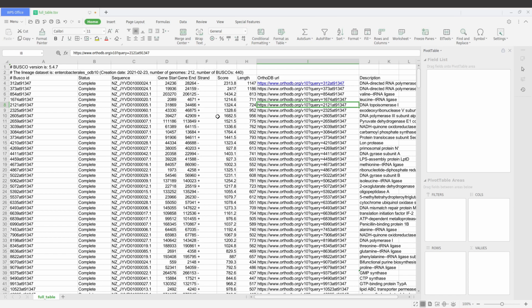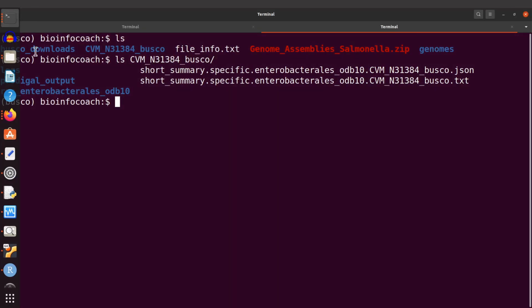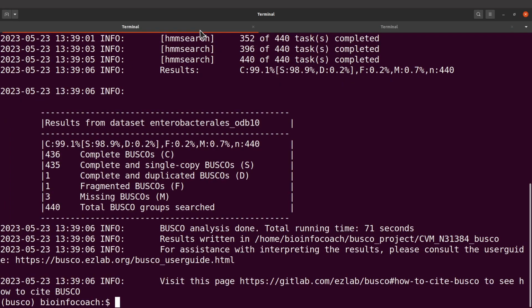That is beyond the scope of this tutorial, by the way. This is an intro video. So I'll skip a detailed explanation of all these, but I will encourage you to check them to understand your data. Now let's get back to our terminal. So we have the summary here, by the way.